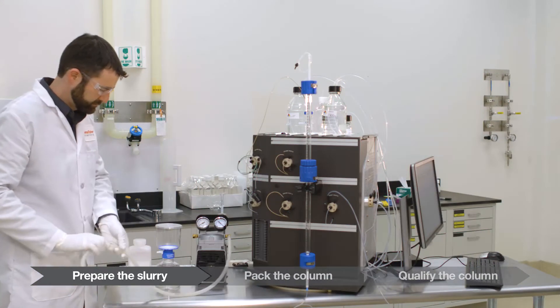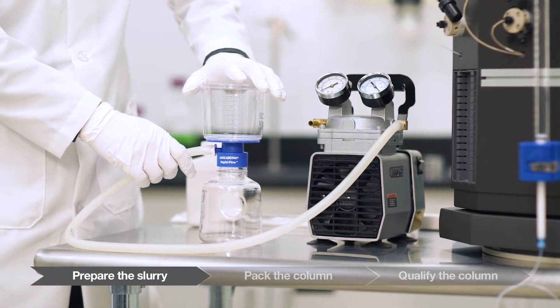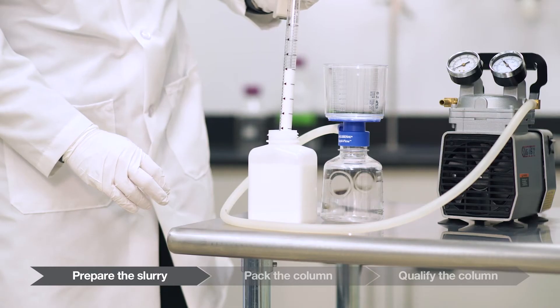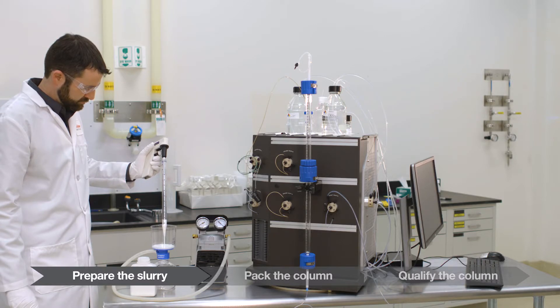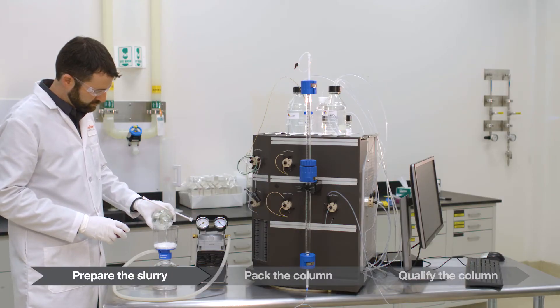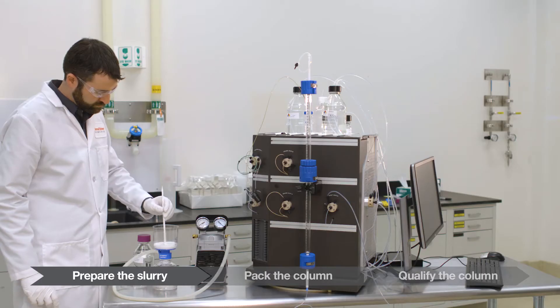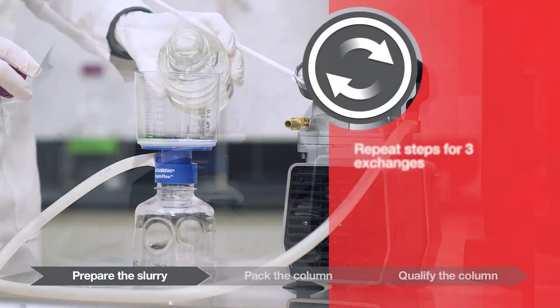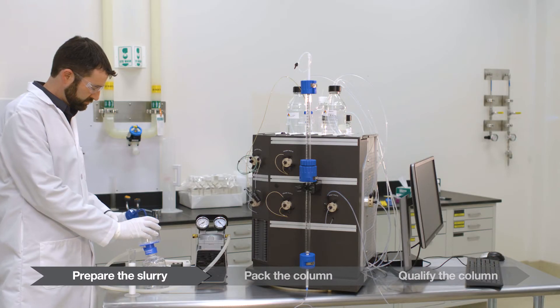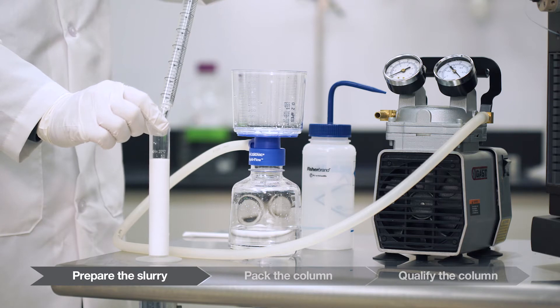The first step is to perform the buffer exchange using a 0.2 to 0.45 micron bottle top filter or sintered glass filter. Gently re-slurry resin in the shipping container and transfer the desired volume of resin slurry to the top of the bottle top filter. Apply vacuum to remove the shipping solution. Resuspend the dry resin bed with packing solution to at least the starting volume. Mix carefully with a plastic spatula — do not grind the resin bed or tear the filter membrane. Repeat for a total of three exchanges. Resuspend the resin and transfer to a graduated cylinder, using the squirt bottle to rinse the filter and bring to a total of 50 milliliters.